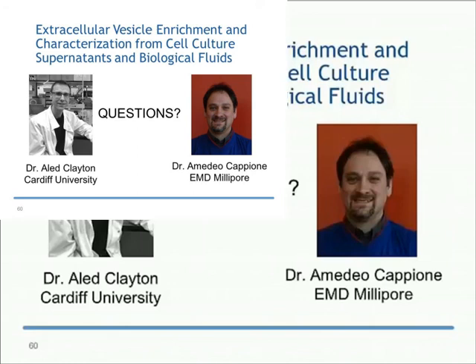There's quite a lot of interest now from both the commercial sector and academic people trying to scale up preps, maybe with a therapeutic application in mind. With respect to that, you're handling hundreds of millions of cells and liters worth of medium, which is really infeasible if you were using a simple filtration or a centrifugation-based system.